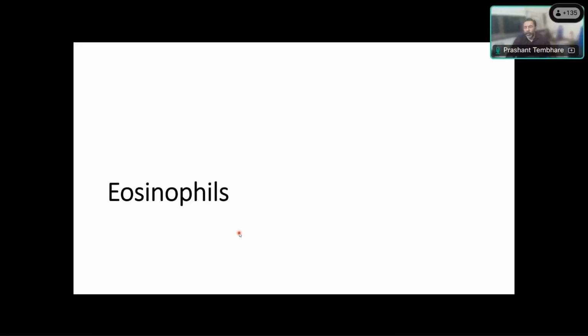Okay, so there are two questions. The first is how are you sure that this is true positive expression of CD41/CD61, the megakaryocytic marker, and not the platelet. This is a $1 billion question. There is no right answer to that. But what the usual flow cytometry expert community follows is that platelets will bind to a subset of blasts, right?